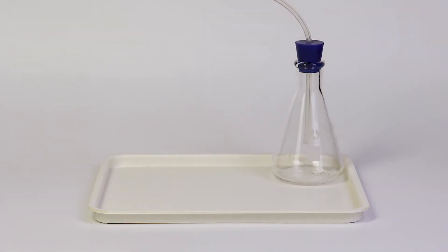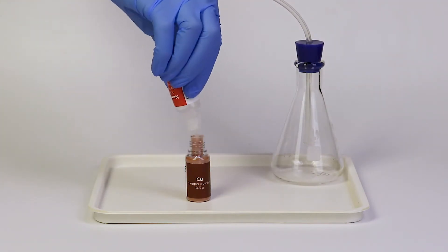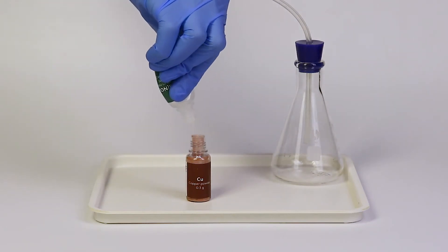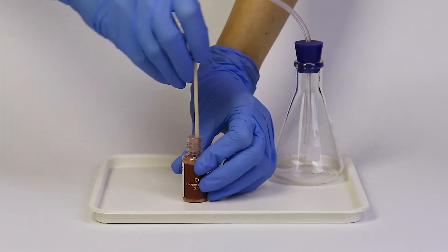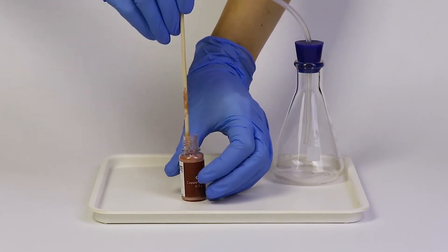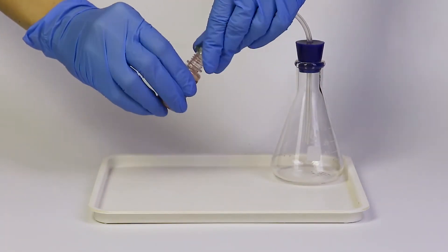Then, take a bottle with copper powder and pour in there a bottle of sodium hydrogen sulfate solution. Add calcium nitrate solution. Stir the obtained mixture with a wooden stick and close the bottle with the nozzle.